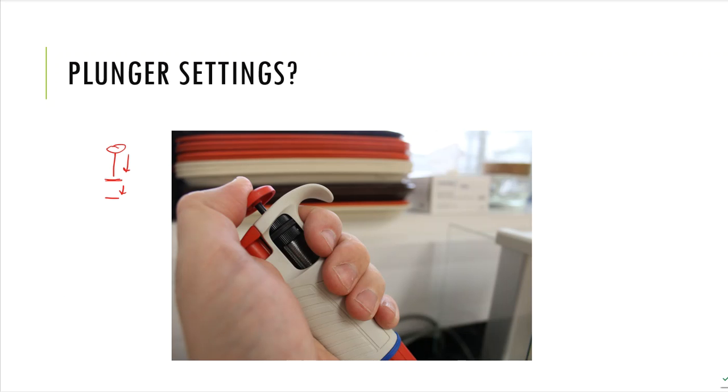And when I slowly push down on this plunger, I'm going to go to that first stopping point, and the majority of my liquid will be out of the tip. But there could be a little bit of residual that's still left. So the reason that second plunger stop is present is because this will deliver a little poof of air through my tip.